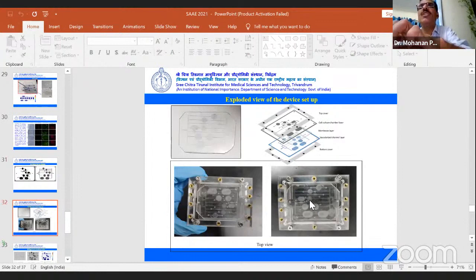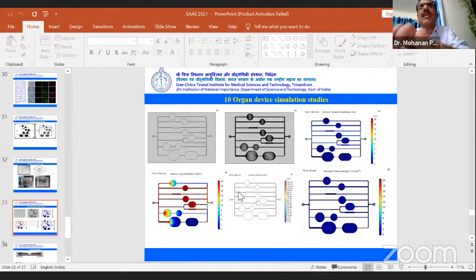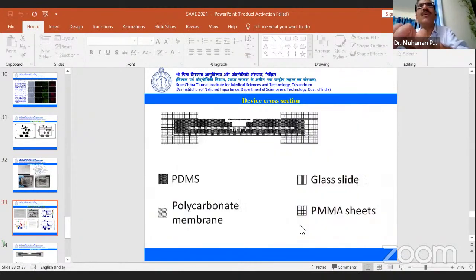This is the latest device with the 10 organs. And here you can see a top layer and the bottom layer. And this is the vascularized one. You know that at the bottom layer there are endothelial cells, and over that there is a semi-permeable membrane. Then the cells of your interest, and then over that the flow will be there continuously with an inlet and outlet. Okay, here also there is a flow, but it's not working.